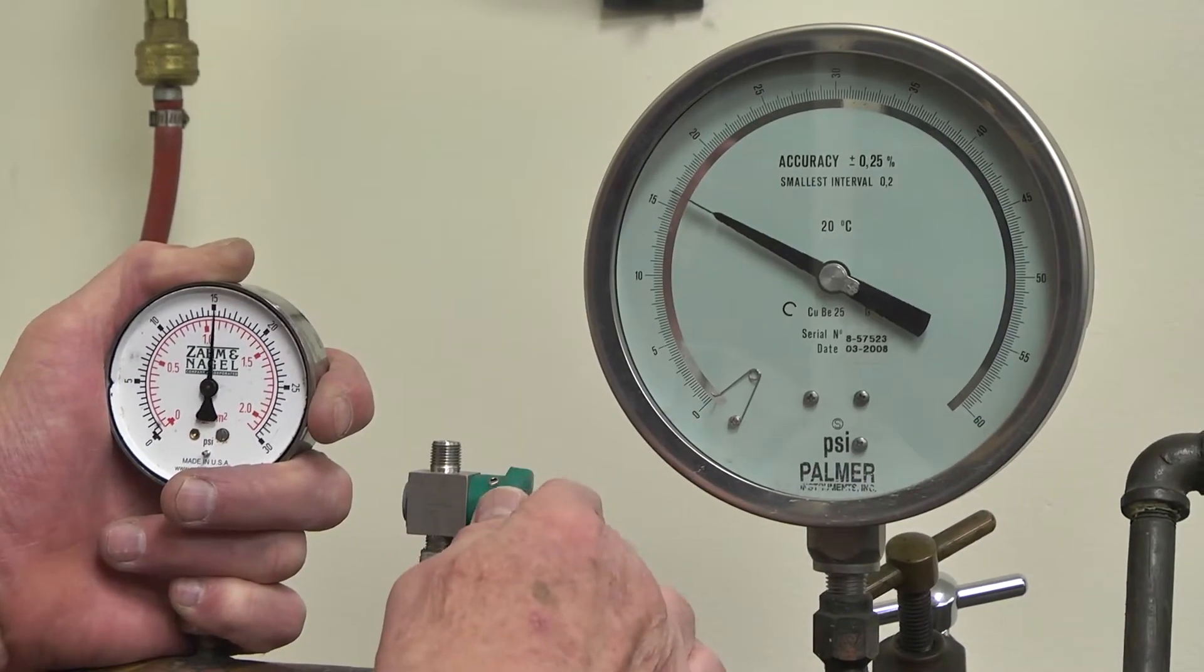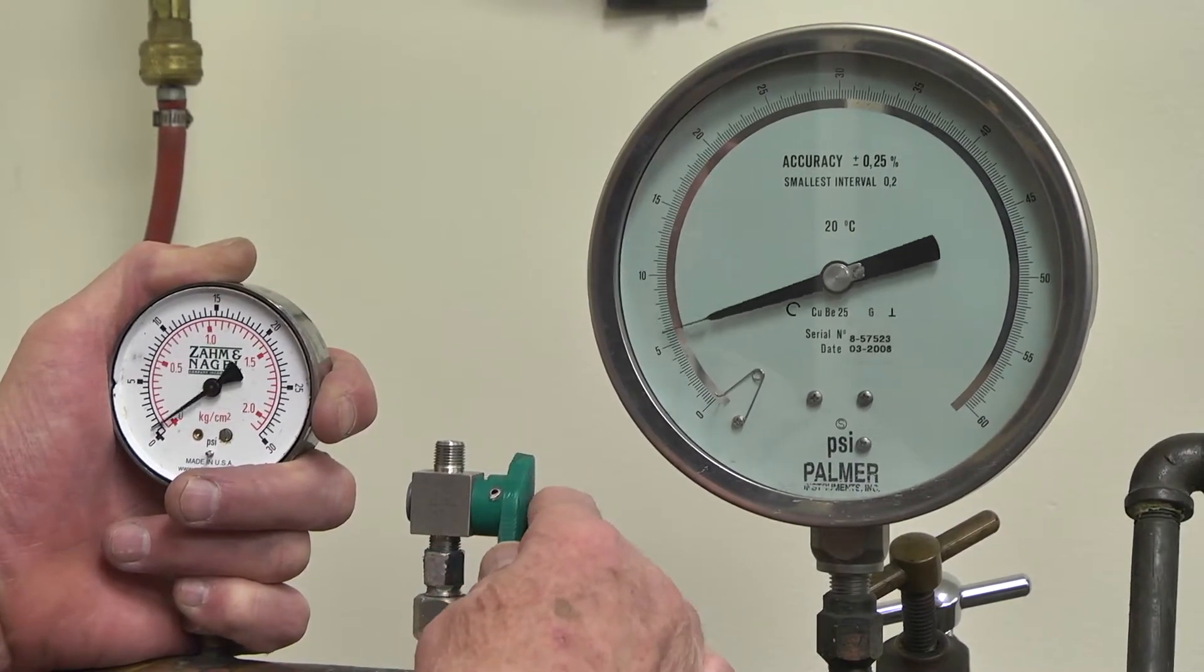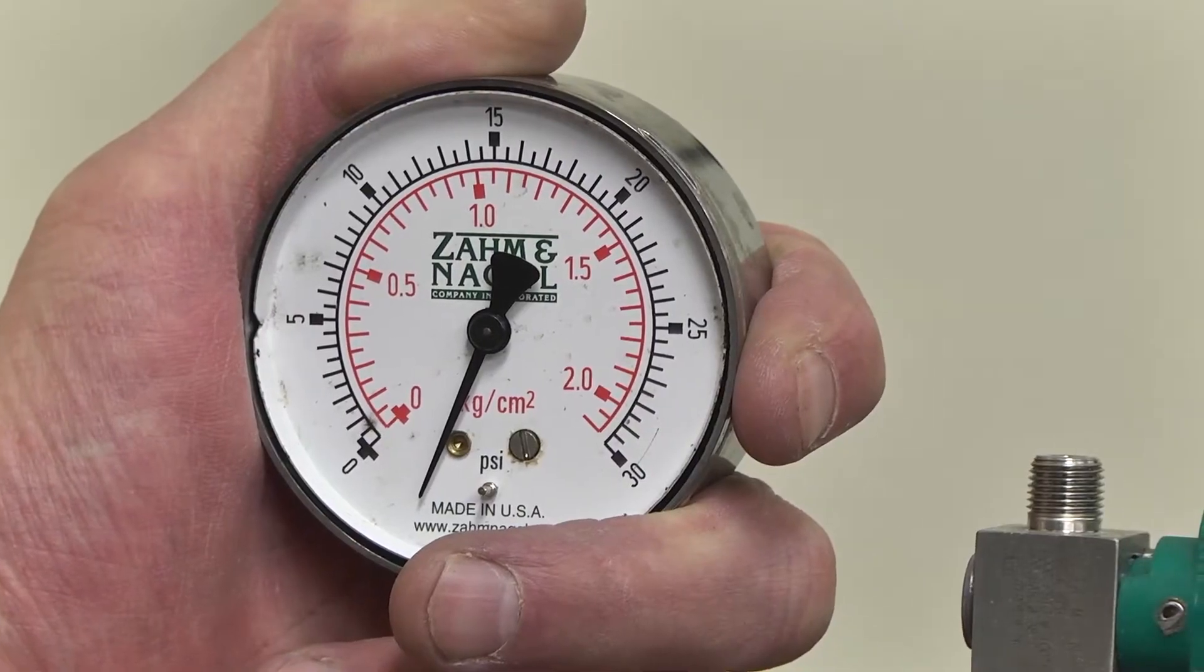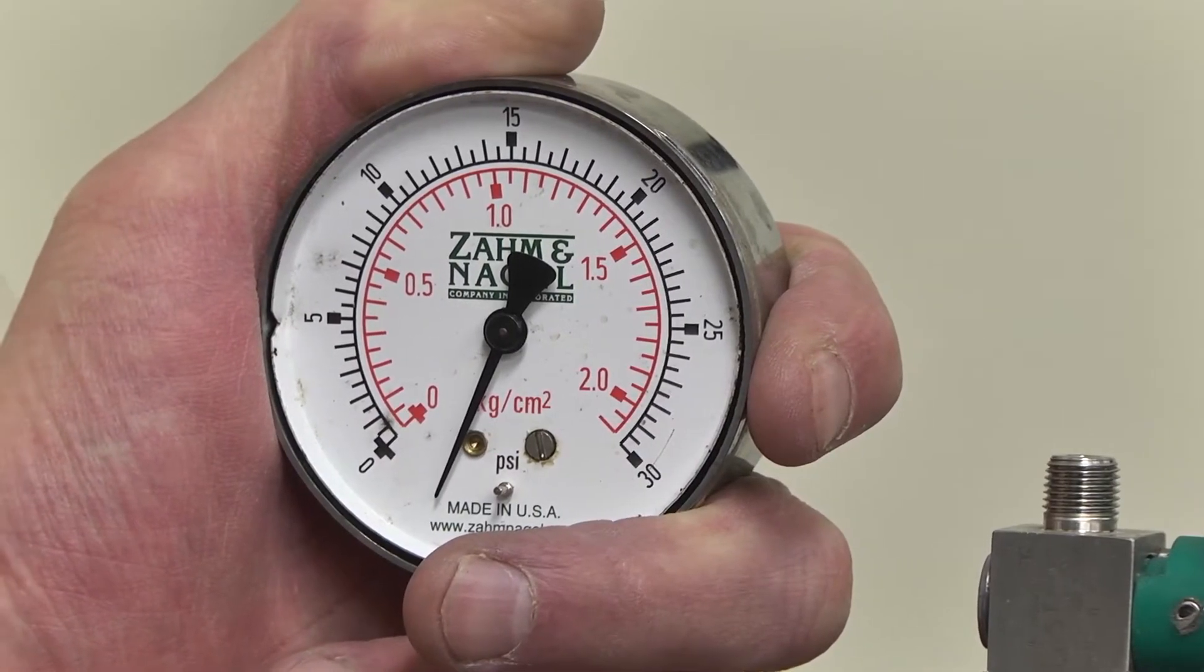Release the pressure on the gauge tester. The pointer may rest anywhere within the black zero range of the gauge. If it falls outside it, the gauge needs to be replaced.